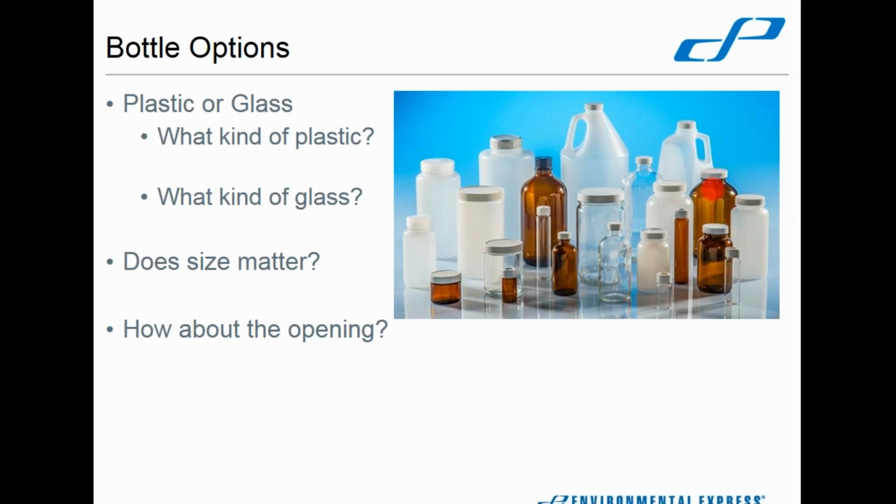Your lab personnel often will prefer these smaller mouth bottles for the exact opposite reason, that it's easier to pour out of and direct that flow into whatever particular container you need, whether it be your graduated cylinder to measure something out, or a beaker for some pH adjustment or a meter analysis.